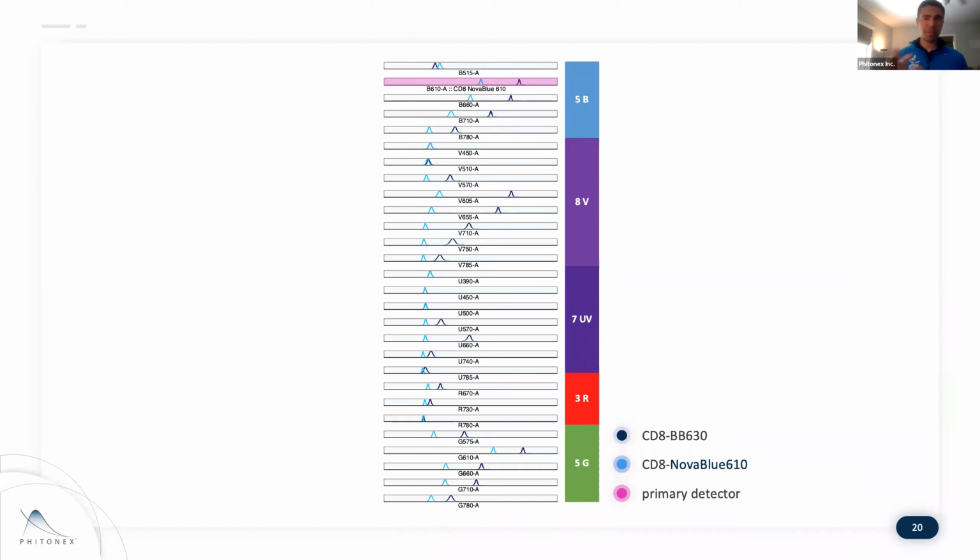We'll come back to this notion of what is brightness in a minute. But there's a cost of doing business for being that bright for this Brilliant Blue dye, which is that it's incredibly fluorescent in the violet, right? And this is something that we've seen with a lot of the Brilliant Blue dyes, which you can expect, honestly, based on their sort of parentage.